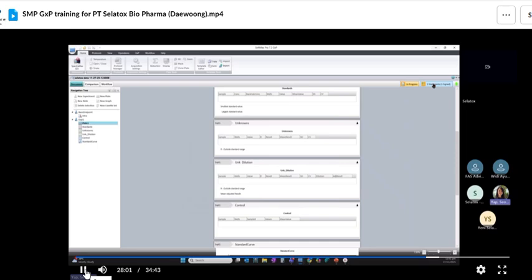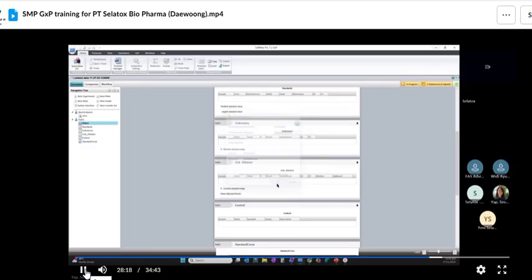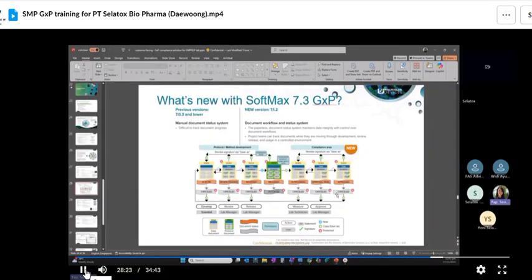Okay, so once it is signed, then next, you change it to approval pending. Then confirm your username and password. Okay, now auto log off. Next, last step: as a lab manager, log in, check it, and approve it.